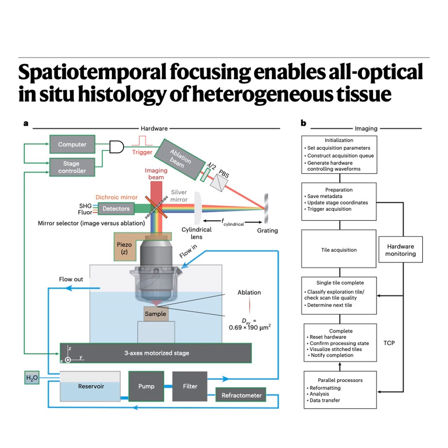Okay, so mechanical cutting is out for this kind of in situ work. What about chemical methods, tissue clearing? That has its own issues. Clearing agents often struggle to make materials as different as bone and brain transparent uniformly. You might clear the brain okay, but the bone remains opaque, or vice versa. It's very difficult. So this brings us to the focus of our deep dive today.